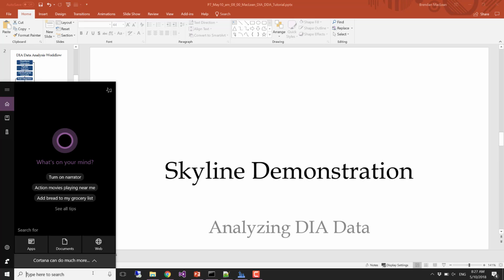People are just walking in. These are the flash drives for the course. We're going to have to share, but at this point there are few enough people that everybody can have one. There's less than 60 gigabytes on here, and they're absolutely packed, with about 1 gigabyte left on them. So you have to copy these off onto your hard drive. I've done that by creating a USB folder in my documents folder, and that's where I'm going to go right now.